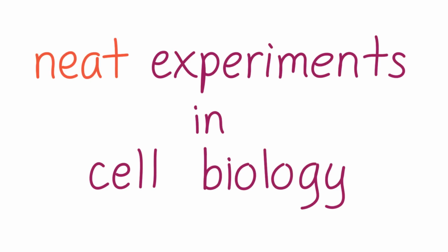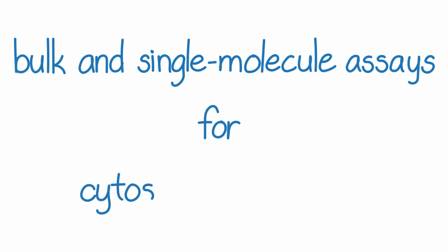Neat Experiments in Cell Biology, a video. Bulk and single molecule assays for cytoskeletal activity.